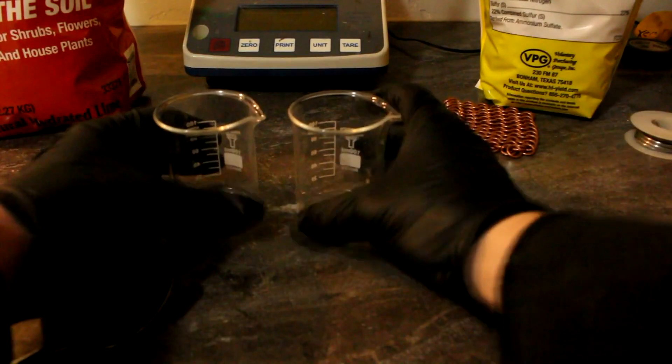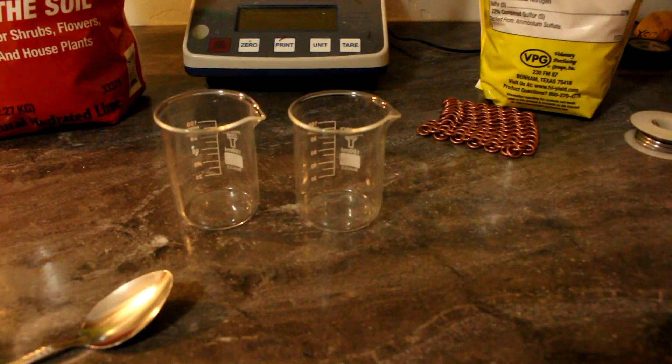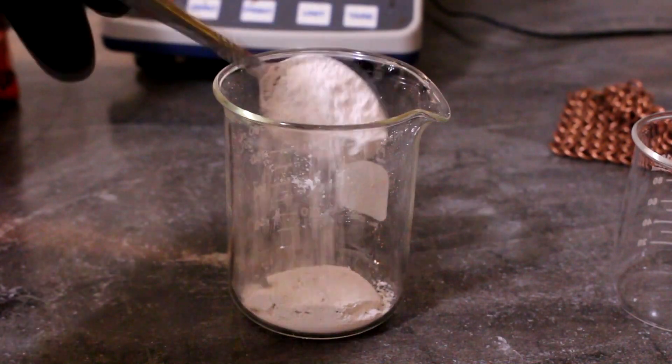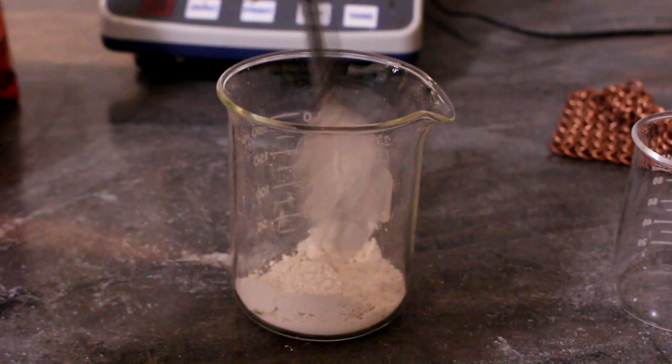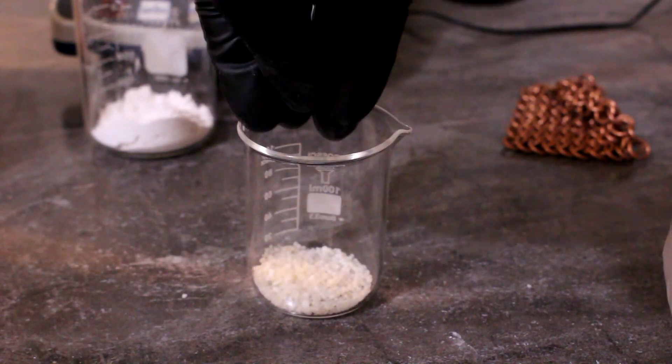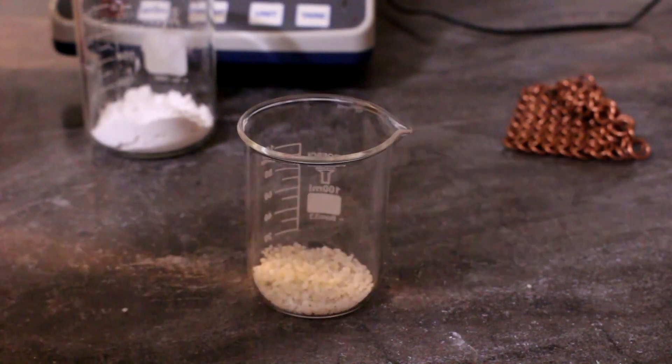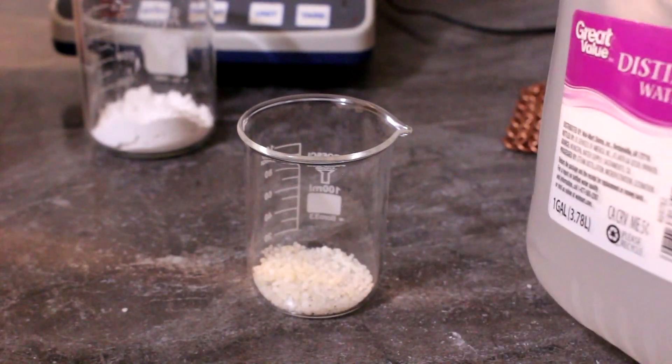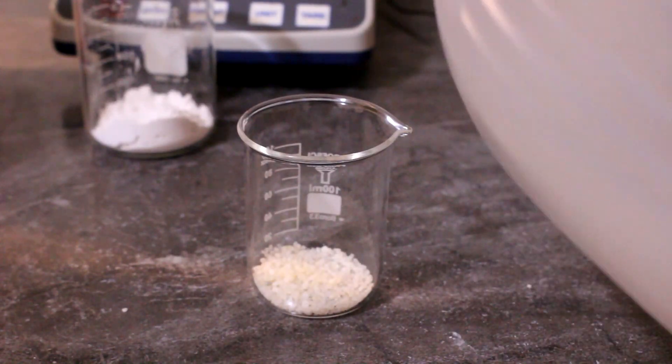So without further ado, let's mix up an ammonium hydroxide solution. First let's add a few heaping tablespoons of slacked lime to this beaker here. Next I'm going to add some ammonium sulfate to this other smaller beaker and I'm going to add enough water to completely dissolve it.